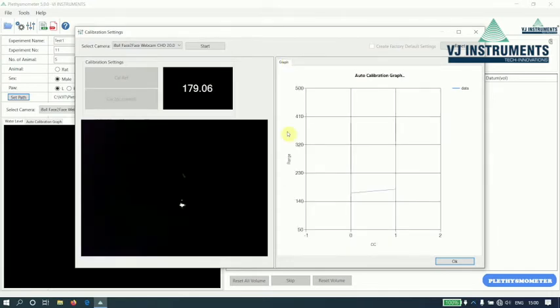The calibration settings is a one-time activity. We don't have to do it every time we open the application. Click on OK button.